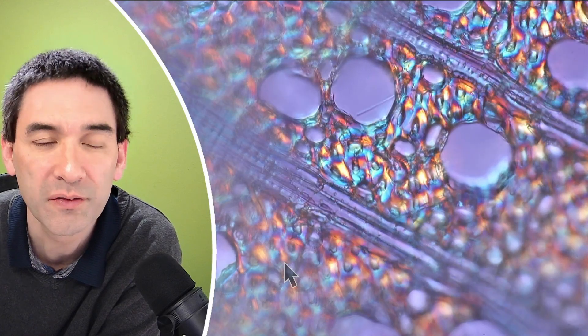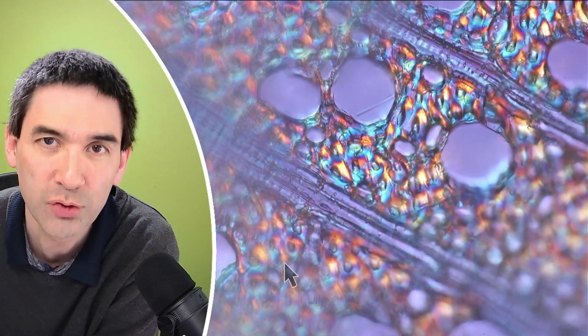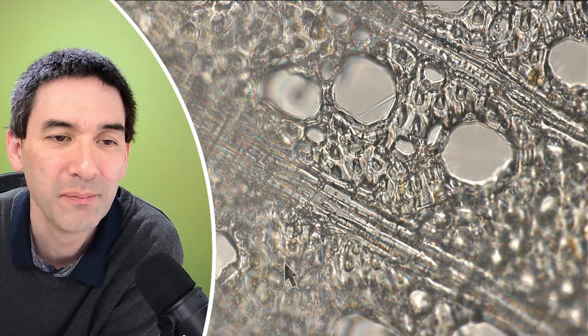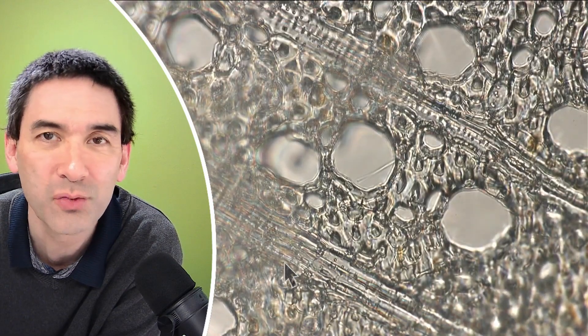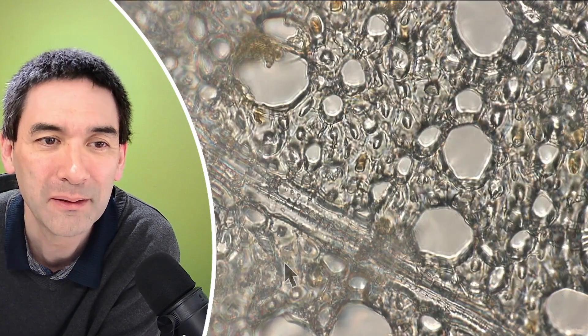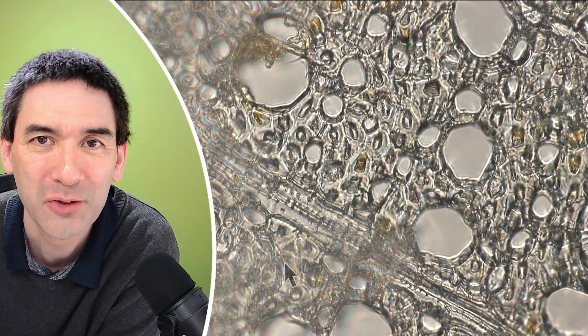The colors that you see here, that's because of the polarized light. Let's try bright field. Here in bright field you can see that all of the structures are still quite nicely visible, but of course not so many colors.